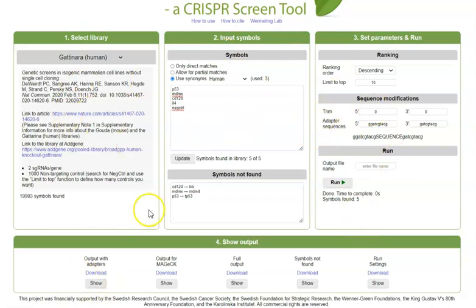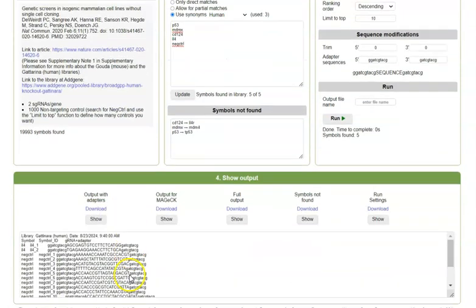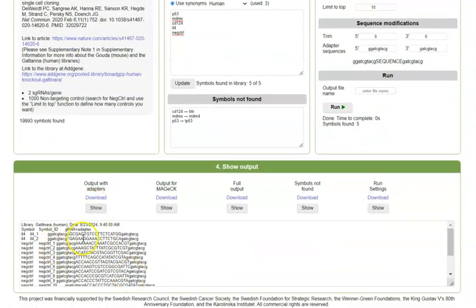So if you're happy with what you generated, you can just download this into a folder, you order the library, and you have all the information there that you need for the project. And just to make the point, you can download all of these ones, and I recommend that you do that, but you can also very rapidly just press show here and see how they look.